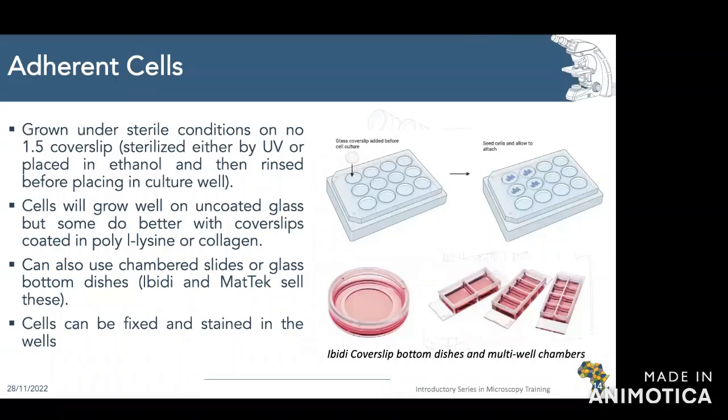So what's really nice and convenient about this method is that everything is really present in this micro well format, and then you can do your fixation and your staining in this well without really worrying about anything running off or different slides that you have to move around. And only at the end, when you're ready to mount, you just fish out your cover slips. So this is a really convenient way. And so you can prepare lots of different conditions with stimulation or inhibition and do this kind of at scale.